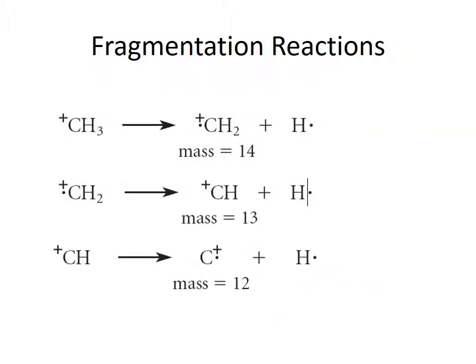What else would you see? Sometimes you'll see more free radicals coming off. So you're going to see a lot of little peaks in addition to some bigger ones that are more recognizable.